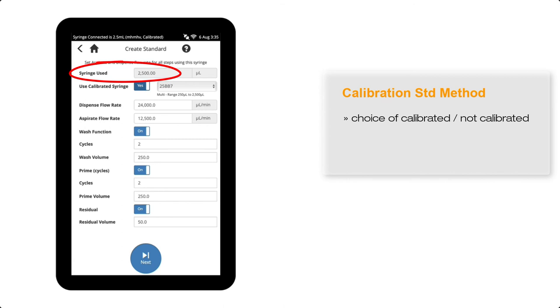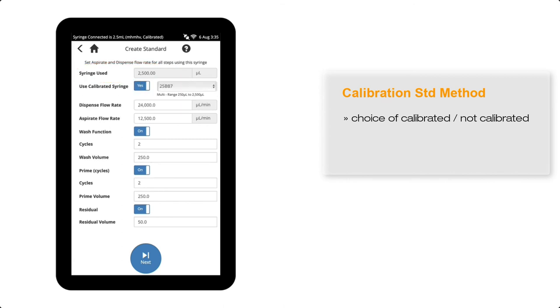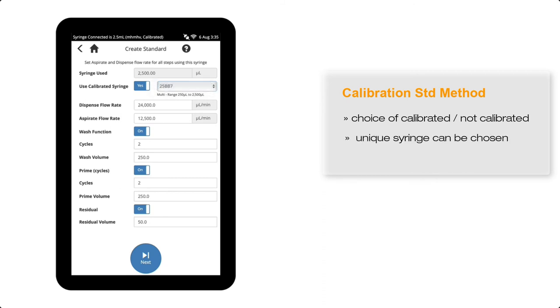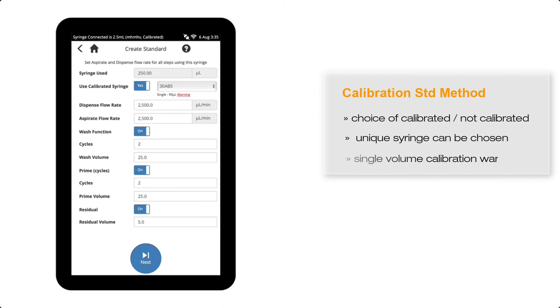As we have a look at the parameters for the 2,500 microlitre syringe, we have the choice of using the syringe as calibrated or not calibrated, and if we had more than one calibrated 2.5 mil syringe, we could select another one through the serial number.